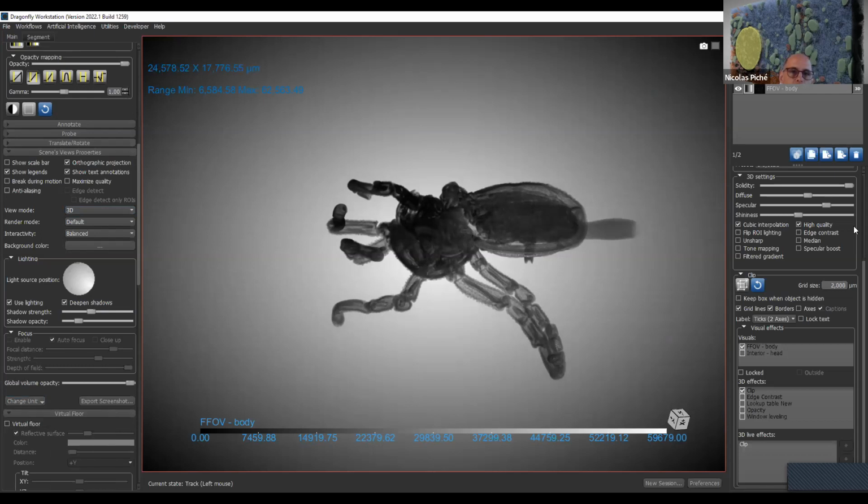But can you also switch it back to pixels without bypassing the calibration? In many cases, I run into this kind of issue, and I need to have the pixel. Well, what you would do is set the spacing to 1 meter, let's say, because for the presentation we're always in real space coordinates, and pixel has no real meaning in that space. So you would fake it by fixing your voxel size at 1 meter.